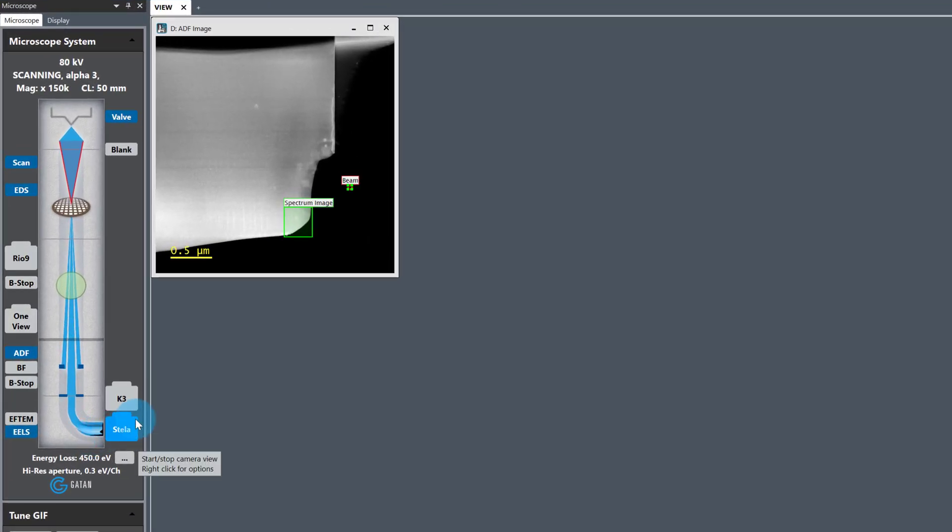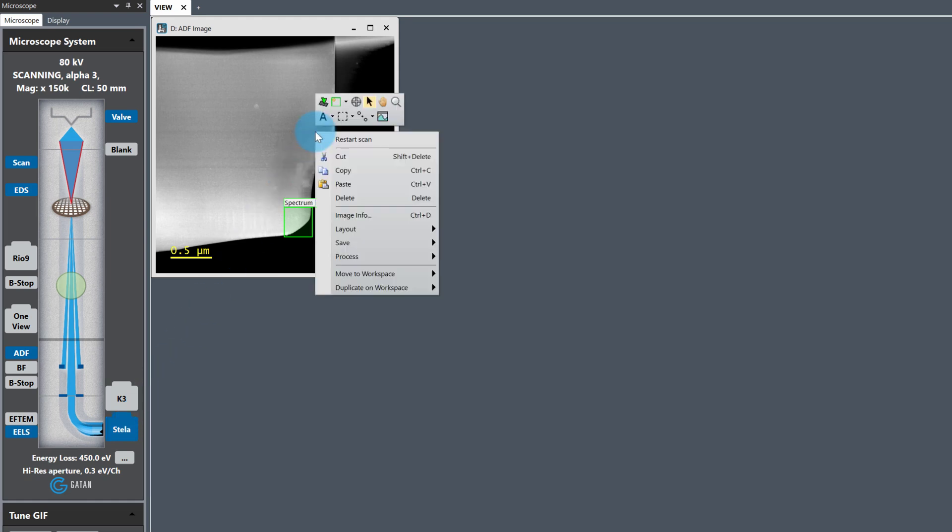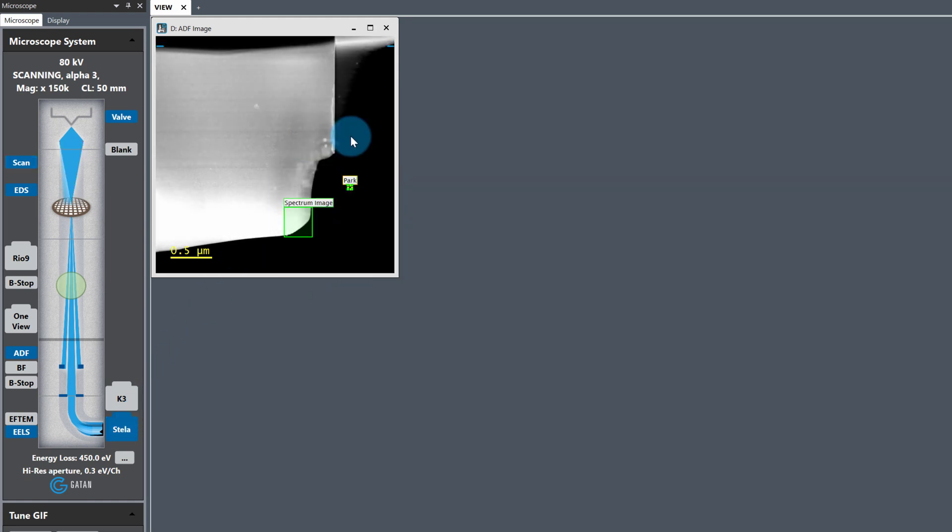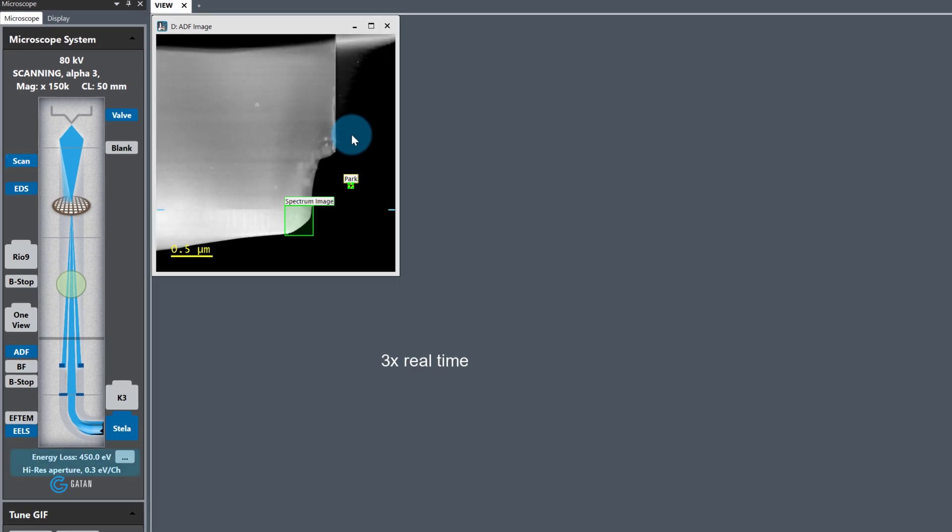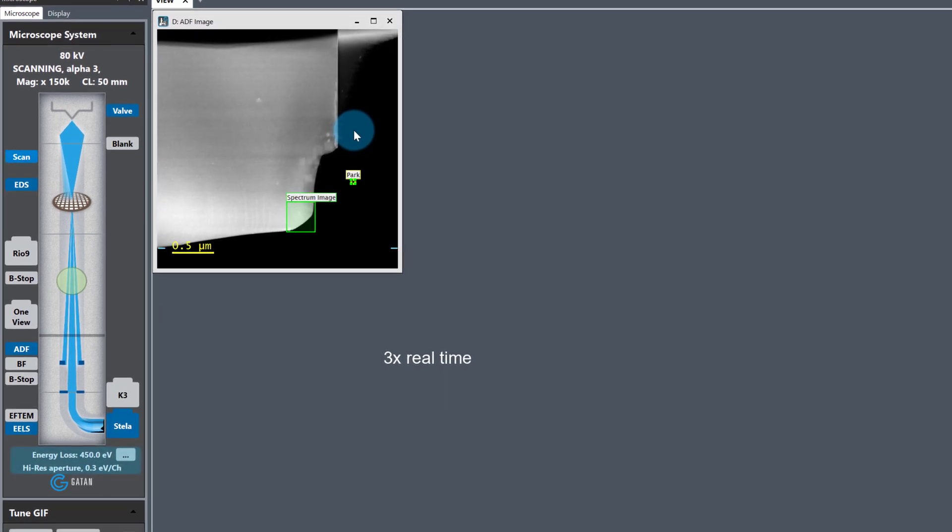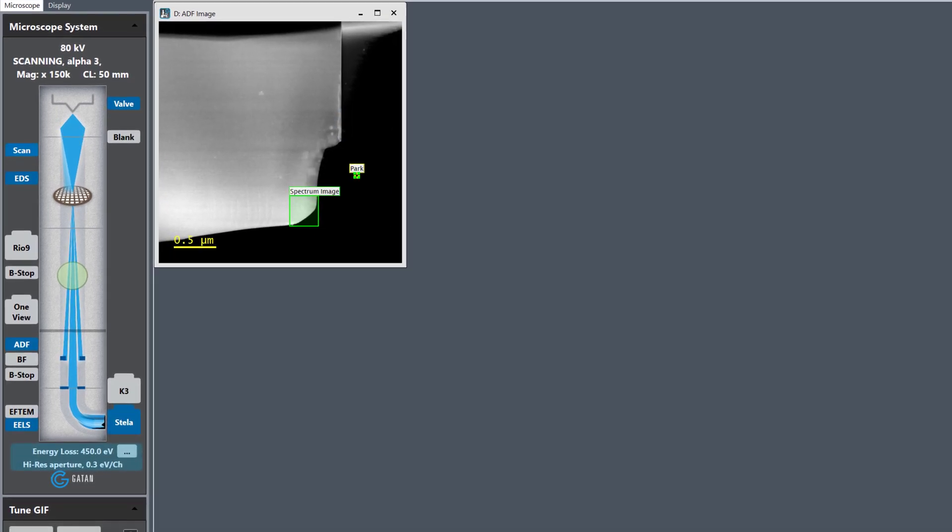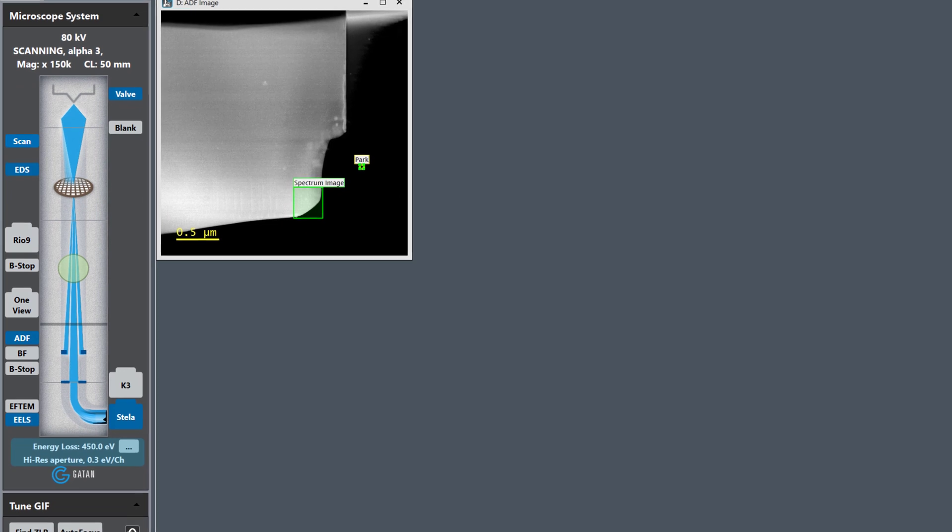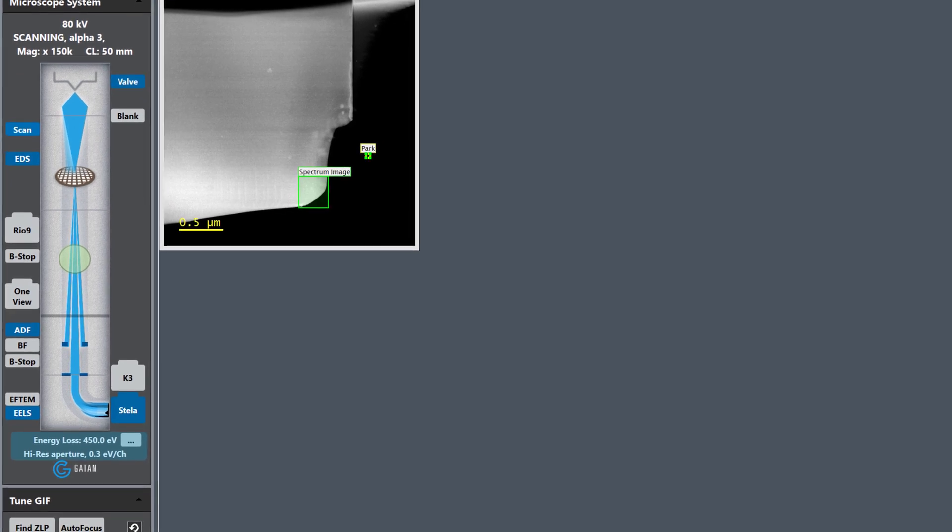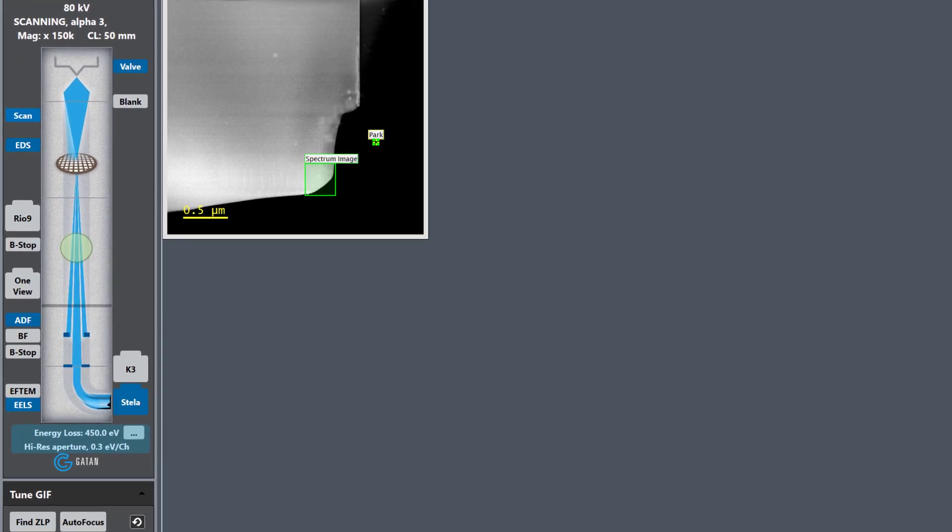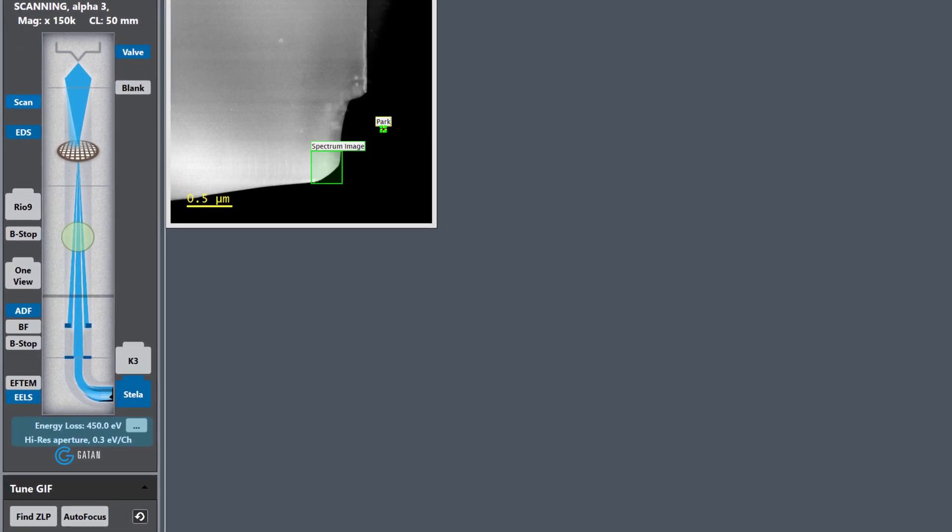The sample I'm looking at is a FIB lamella of single crystal barium titanate and I'm starting off with a 0.3 eV per channel energy dispersion. We can expect around 0.3 eV energy resolution at 80 kV.